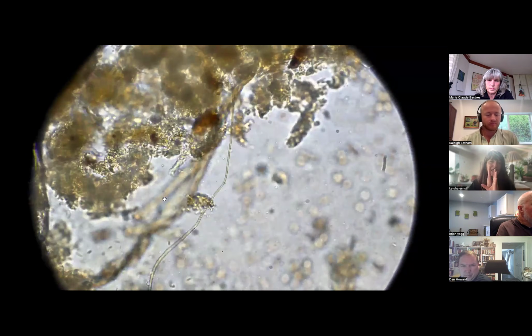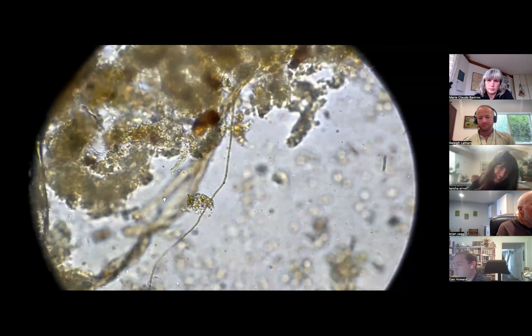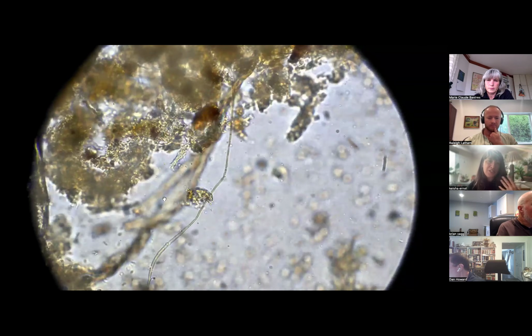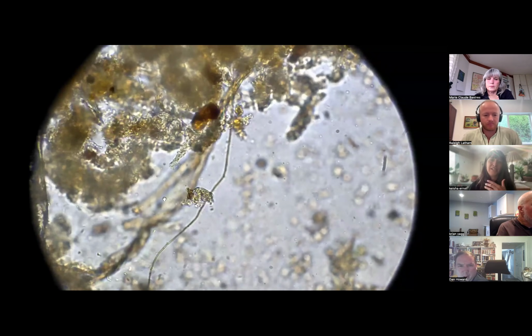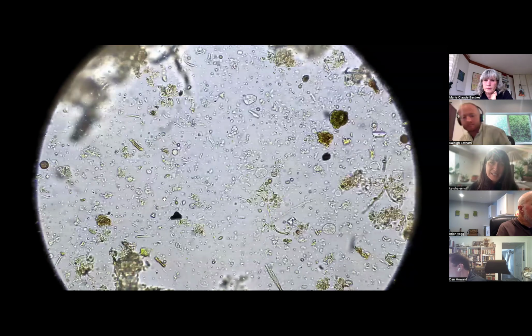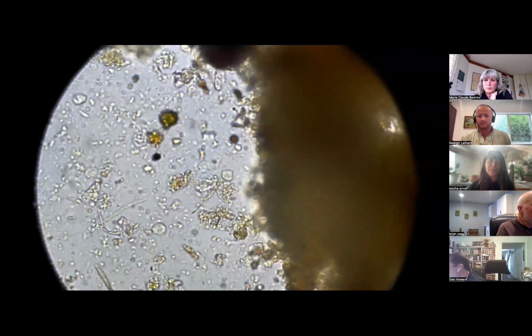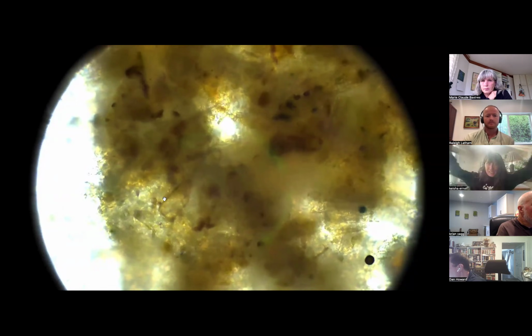I think a lot of people get the idea it's like good, bad. Like as soon as you cross the line, you're in scary town. But truth is, this fungal hyphae, I mean, we don't know if it's alive right now or dead, but you can still see testate amoeba, you can still see cysts, you can see spores. At this point, it hasn't been anaerobic long enough that the bacteria have consumed absolutely all of the organic material and all the life. That's the bad thing that happens in anaerobic soils. Bacteria consume organic material, so when you deprive something of oxygen for long enough, all of it disappears.